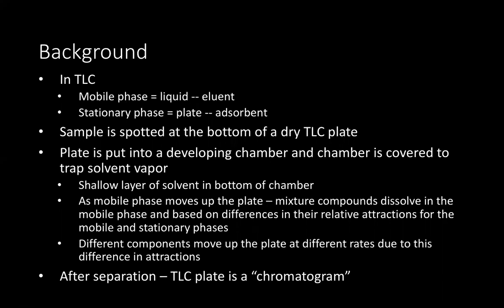Within the chamber, there should be a shallow layer of solvent or eluent in the bottom of the chamber, and your mobile phase will move up the plate. The mixture of your compounds is going to dissolve in that mobile phase, and based on whether your components are more attracted to the mobile phase or the stationary phase, the components will move up the TLC plate at different rates due to these different attractions. After separation, your TLC plate is technically a chromatogram. That's the right terminology for it.